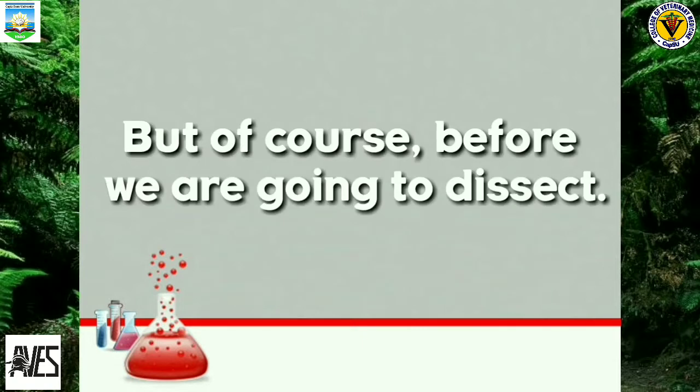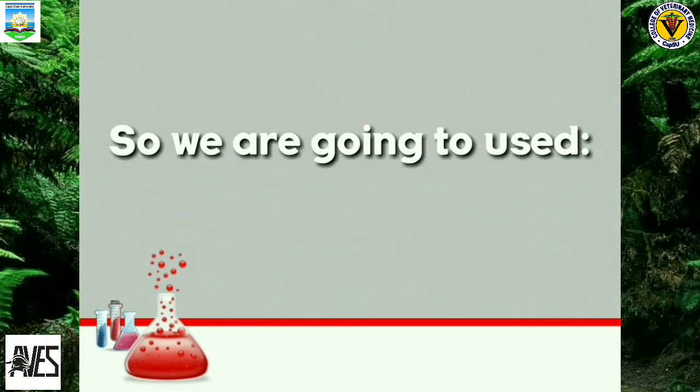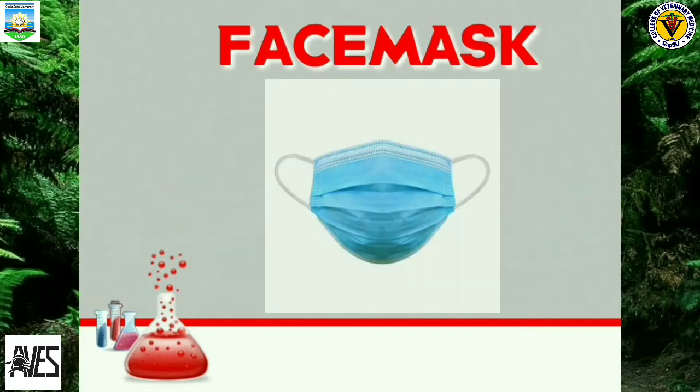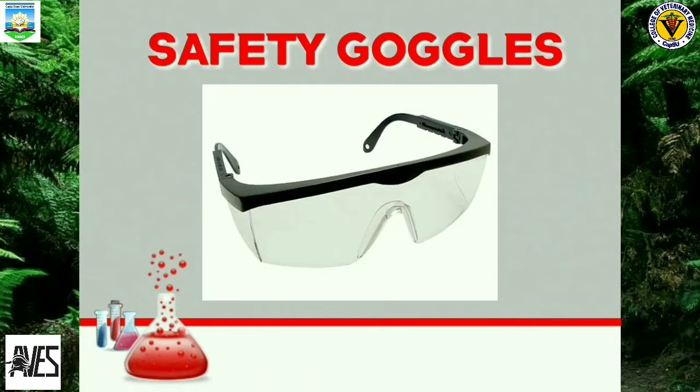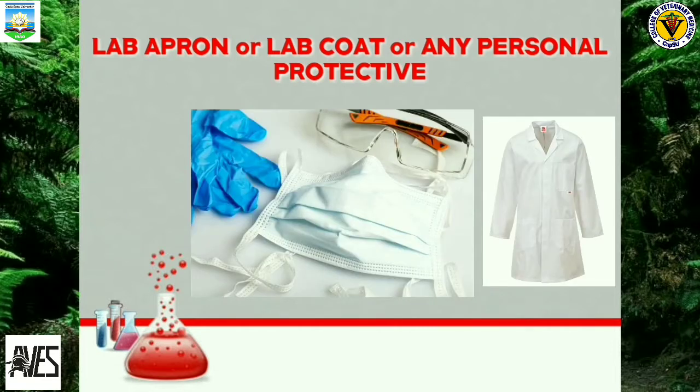But of course, before we dissect, we need first to protect ourselves from specific hazards and hazardous materials. So we're going to use gloves, face masks, safety goggles, and a lab apron or lab coat or any personal protective equipment if possible.